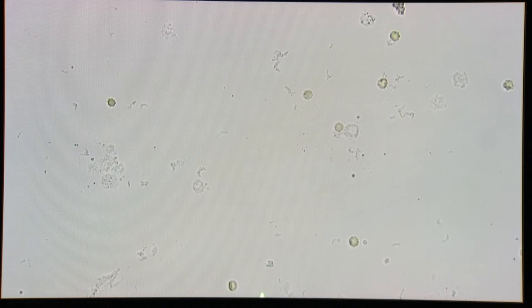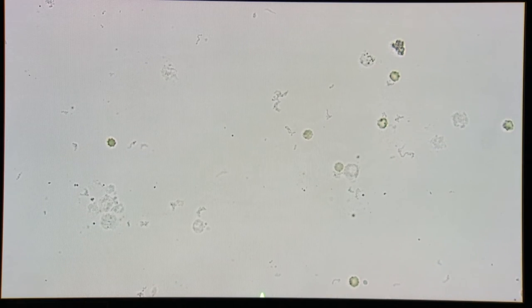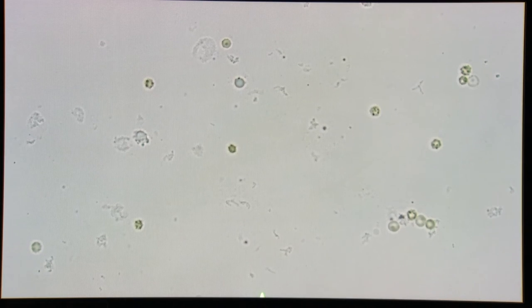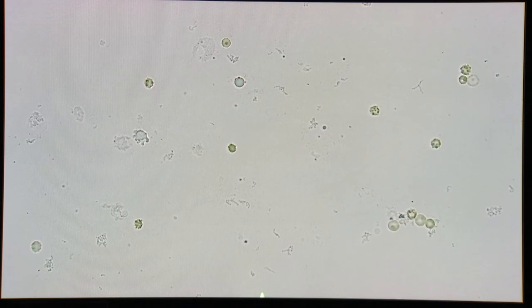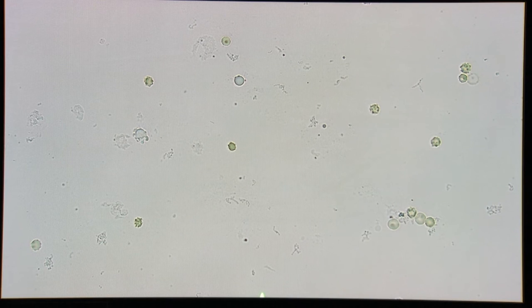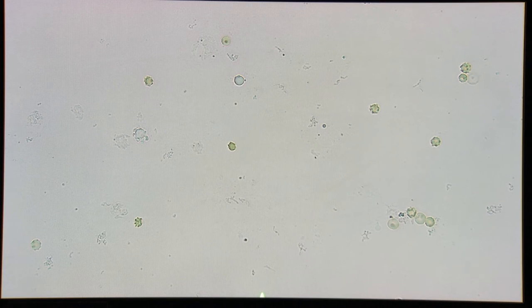For fat, crystals, debris, etc., you average what you see in a field. Scant is approximately 5% of the field, mild is 5 to 25%, moderate is 25 to 75%, and abundant is greater than 75%.